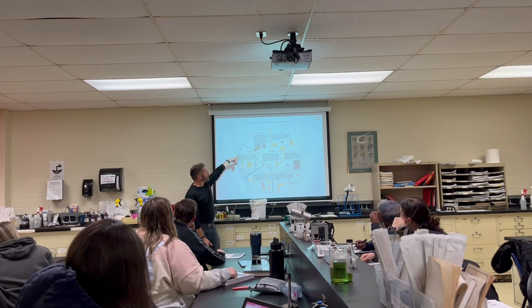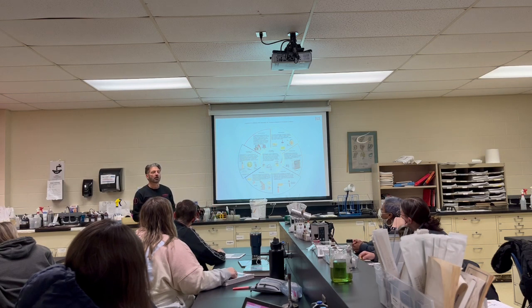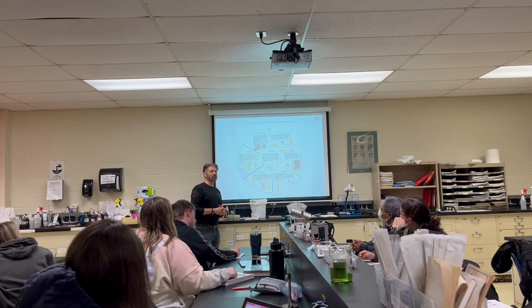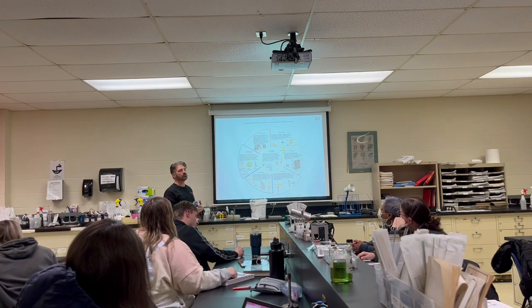grabbing the specimen, we want to incubate it, you know, put it in a nice little warm womb. We have a couple back here. Keep it at a certain temperature to grow. And what temperature do you think the incubator's at, roughly? I don't know, Dr. Phil, probably body temperature. Yeah, body temperature, so around 37 degrees. We want to keep it culturally around body temperature. We're going to be growing organisms that would be effective for us.